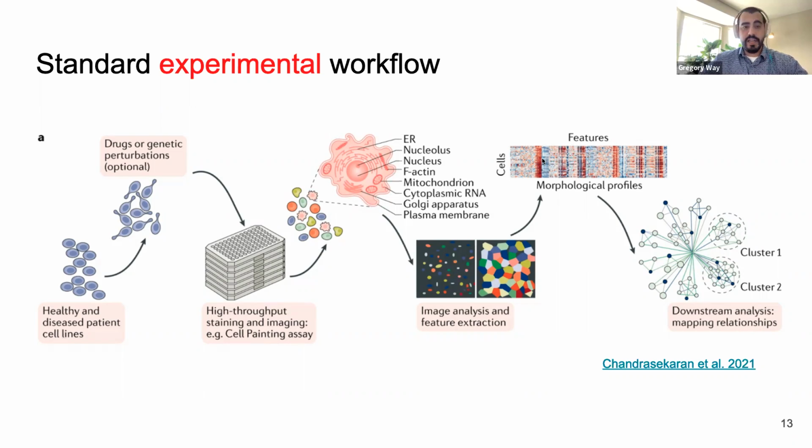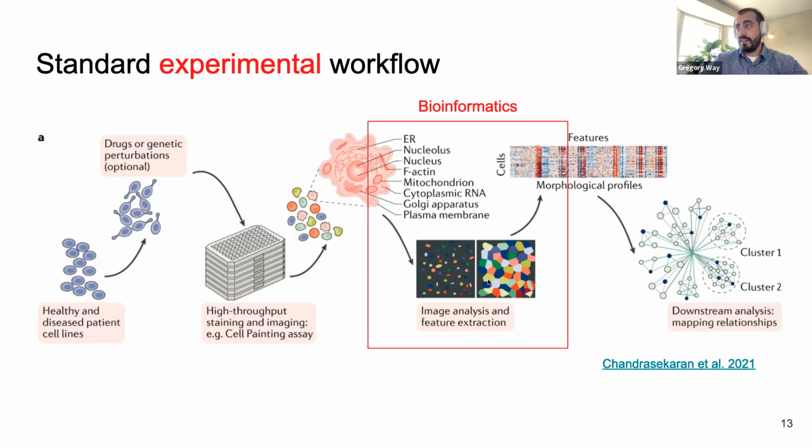So this feature matrix, I feel like probably most folks in this audience would be familiar with this kind of data as they study a whole bunch of different disease contexts in biomedical contexts. You could use this matrix like you would a gene expression matrix or a matrix of protein abundance. And so the bioinformatics really sits in this space here of actually performing the image analysis and the feature extraction, as well as processing this downstream matrix.